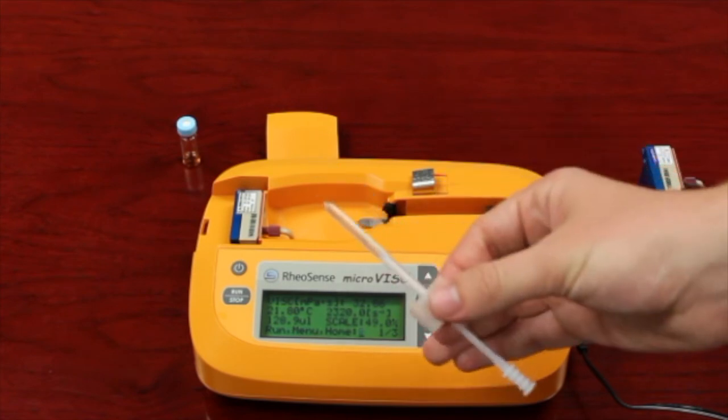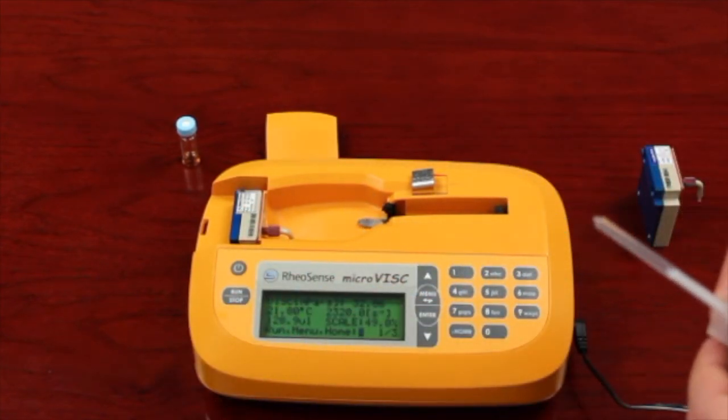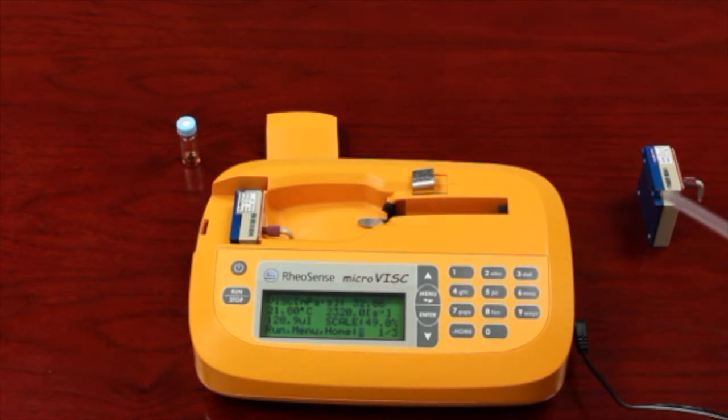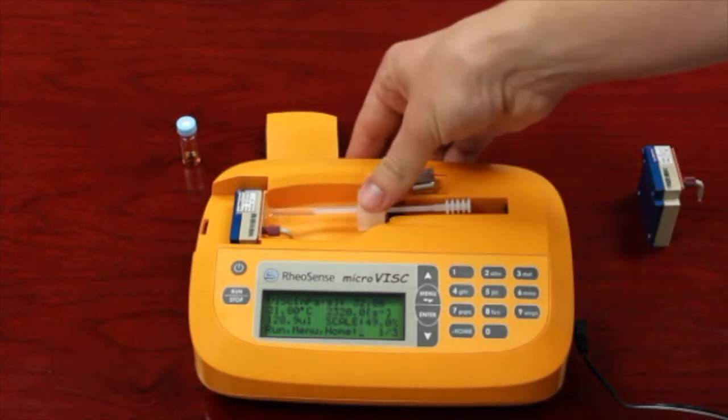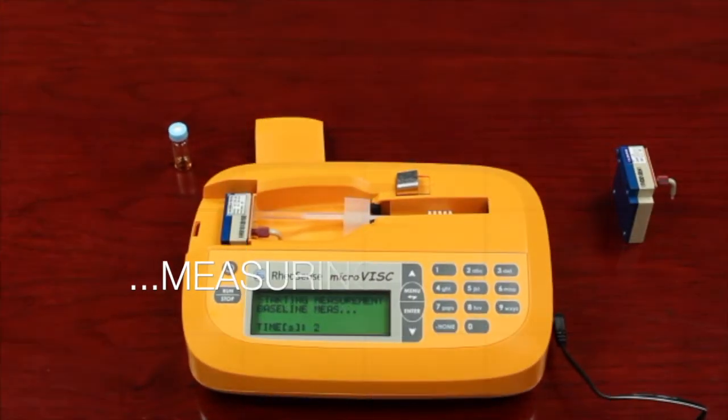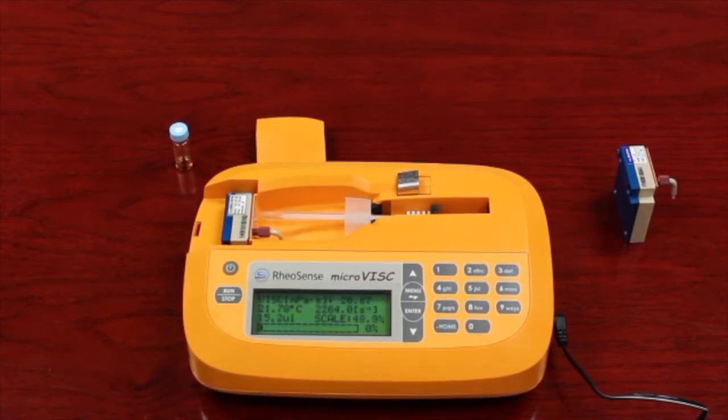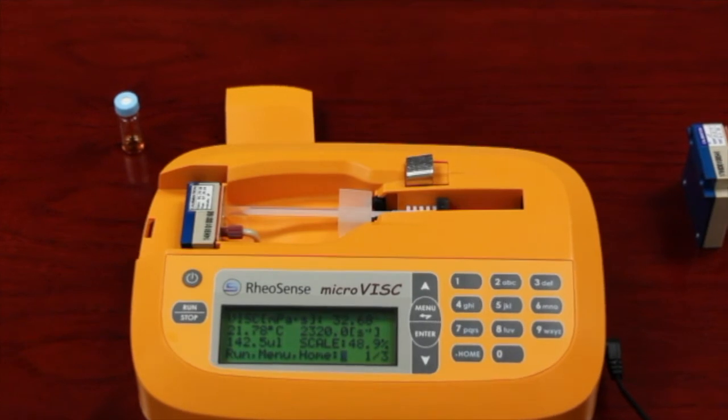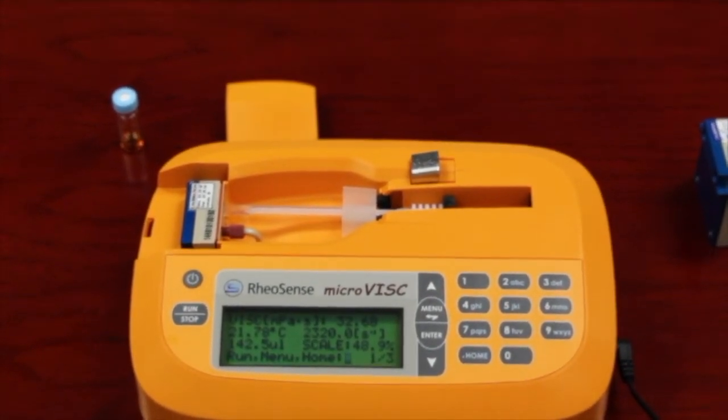So we have our terpene sample that we're going to measure now. And we had to switch out our chip to one that handles lower viscosities because this will be outside of the range that that other chip handles, but we'll go ahead and measure it real quick. All right. So for our terpenes, we get a viscosity of around 32 centipoise.